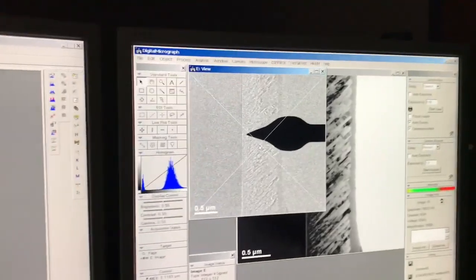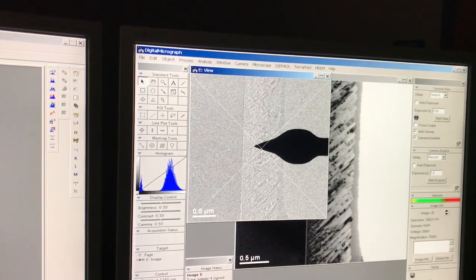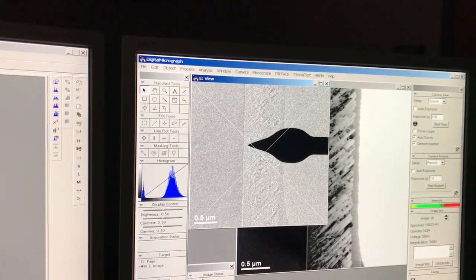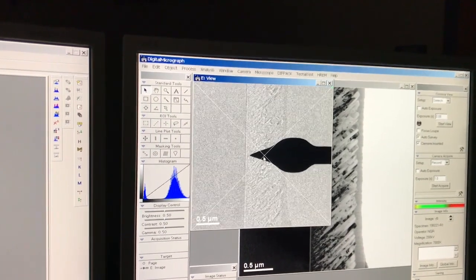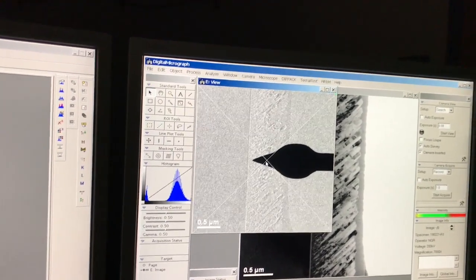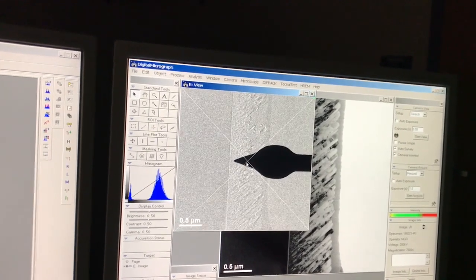Okay, so I'm gonna go ahead. So there's adjustment screws on here. Okay, there's two adjustment screws. There's one here and there's one here. Okay, so I'm making the adjustment here. Okay, so you have right, move it down a little more. It's a little sticky, but that's kind of by design to make sure it doesn't move. Okay, so right there. Okay. So now I've got a beam stop there.